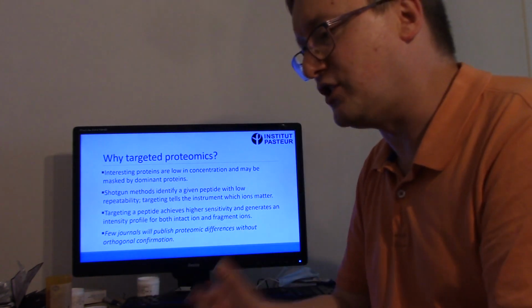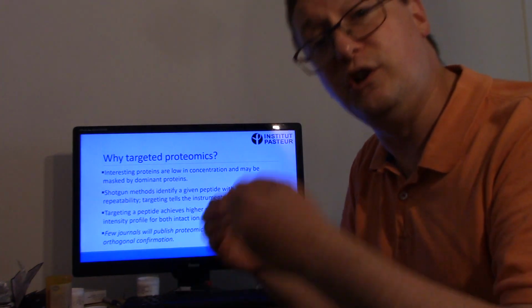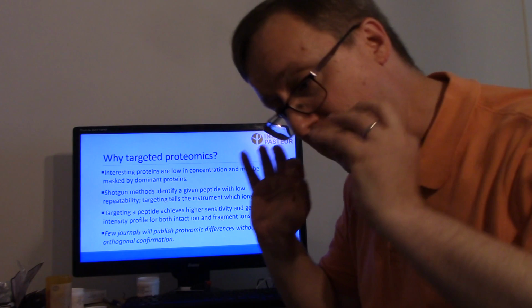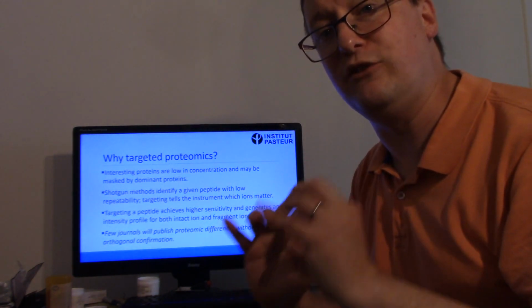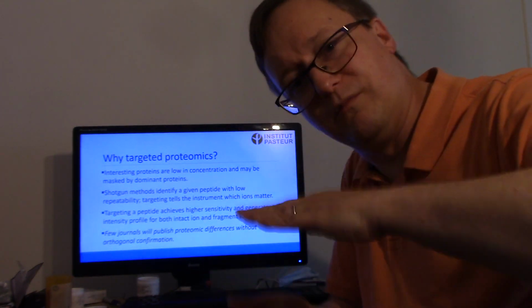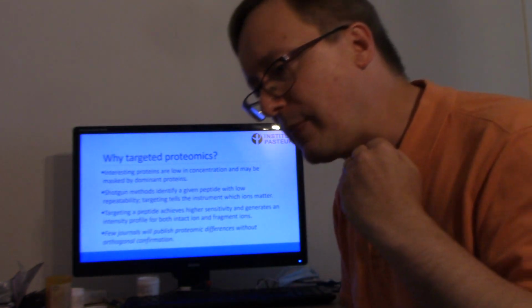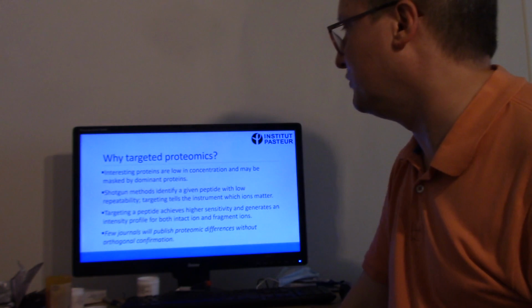Targeted proteomics answers the challenge that if you want a quantitative result, you do a quantitative experiment. Not one of these shotgun things, but rather an experiment that's designed to give you quantitative information with clear ratios and clear error bars for a limited set of proteins.